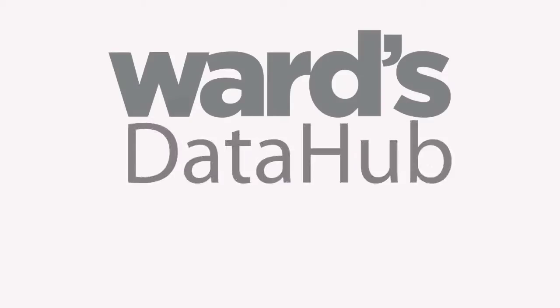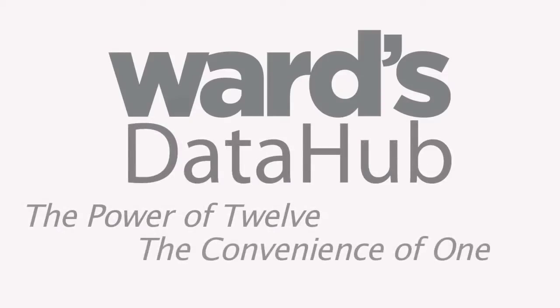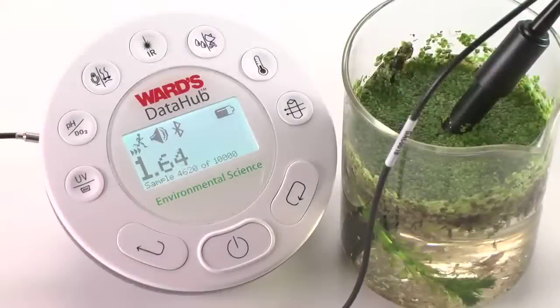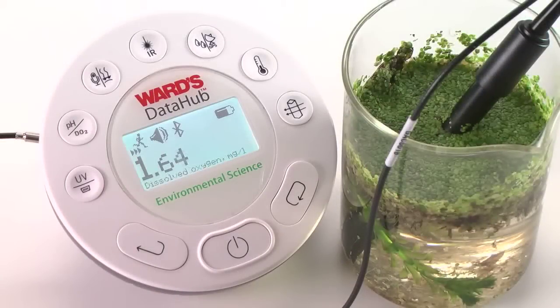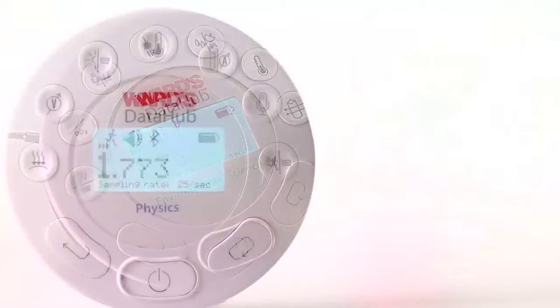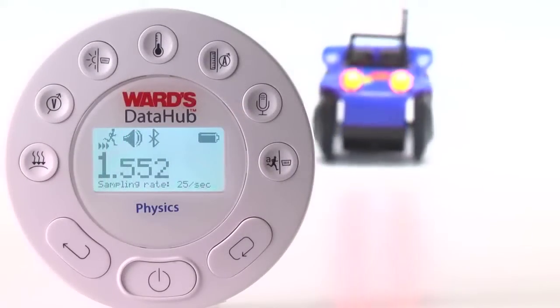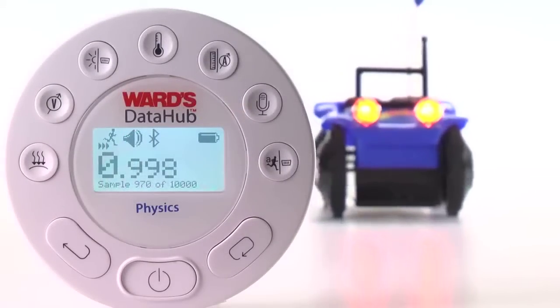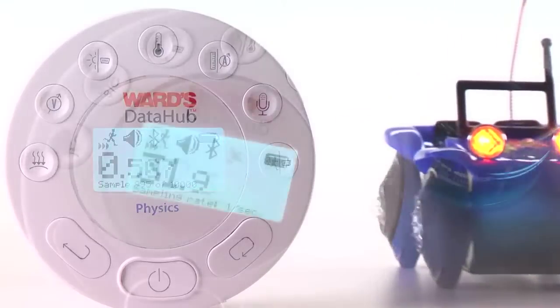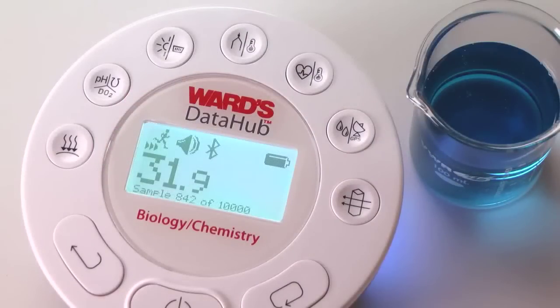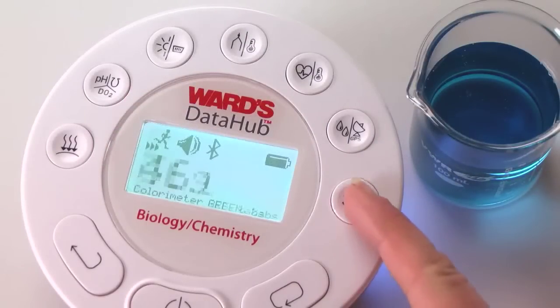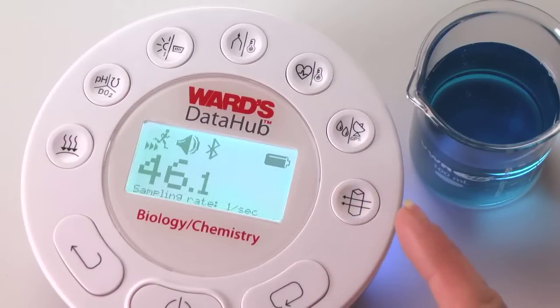Ward's DataHub: the power of 12, the convenience of one. Introducing Ward's DataHub, the only wireless all-in-one probe wear system designed for high school and middle school classrooms. With Ward's DataHub, it's easier than ever to incorporate probe wear into the hands-on science lessons you already teach. The result is faster, more powerful data analysis with every lesson.